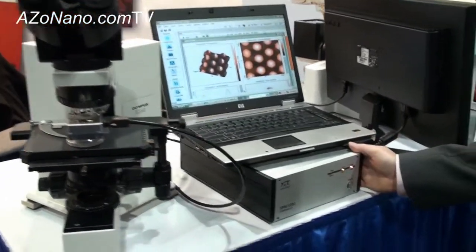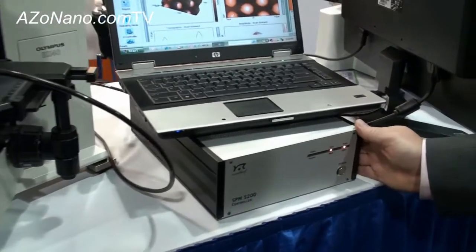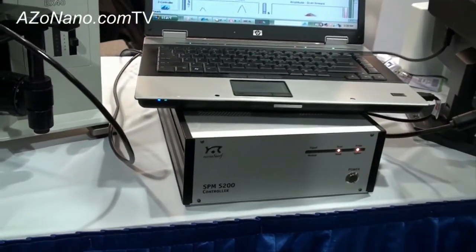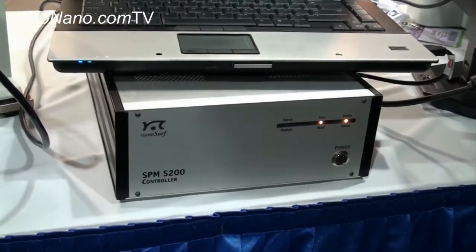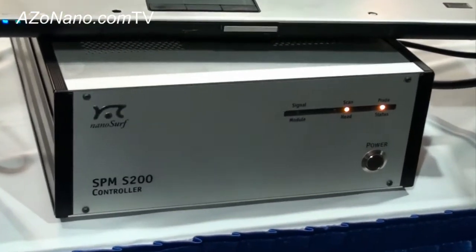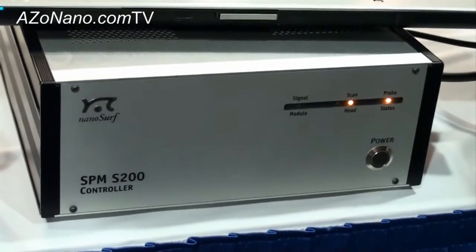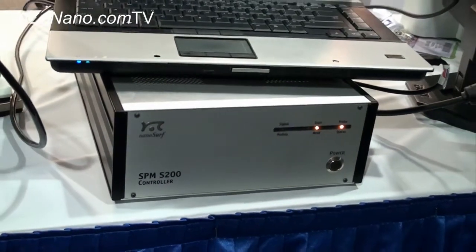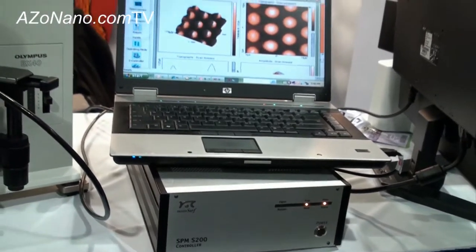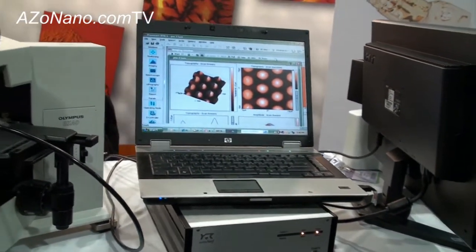The controller of the system is seen here. It is very compact and modular. Once again, the Nanosurf trademark of portability, modularity, ease of use, and affordability are all seen with the Lens AFM, which is one of the newest products that Nanosurf is bringing to the AFM market.